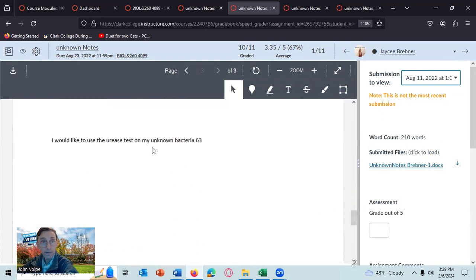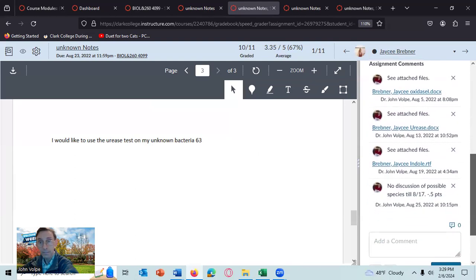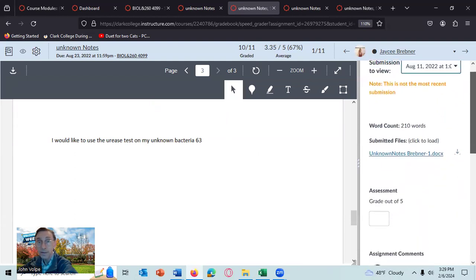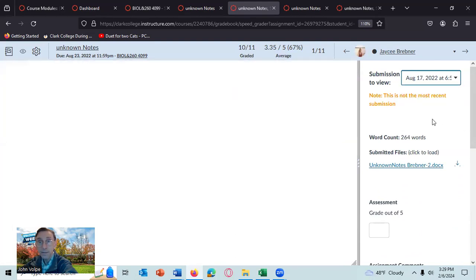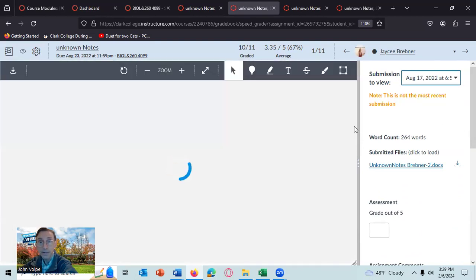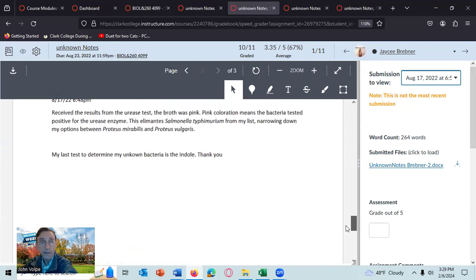And then he gave the next test, the urease test is the next test he asked. And let's see when I sent that out. That's 2 days later, August 13th. I sent out the results. That does need to incubate for 2 days. And he didn't take a look at it until August 17th and put up the results for the urease test.